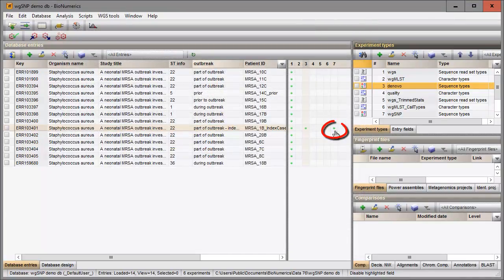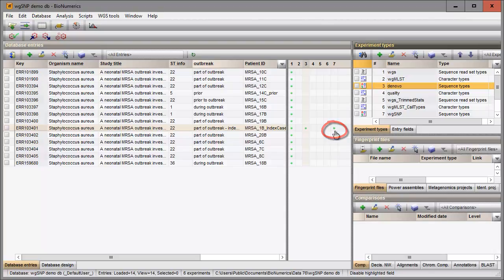The sequence is copied to our new sequence type experiment. Since this is the first sequence linked to our new sequence experiment, this sequence is automatically considered as the reference sequence for this experiment.